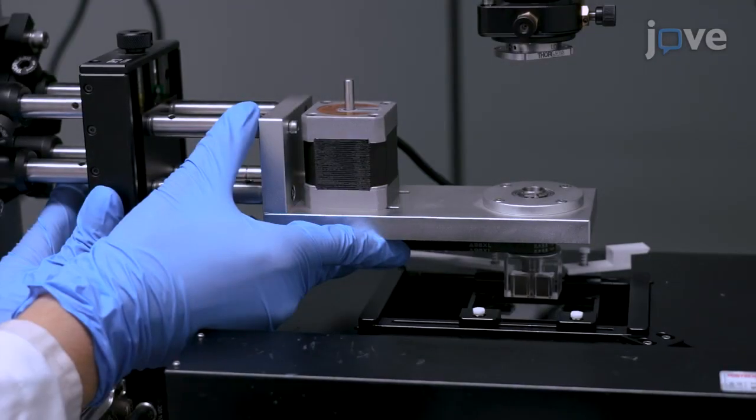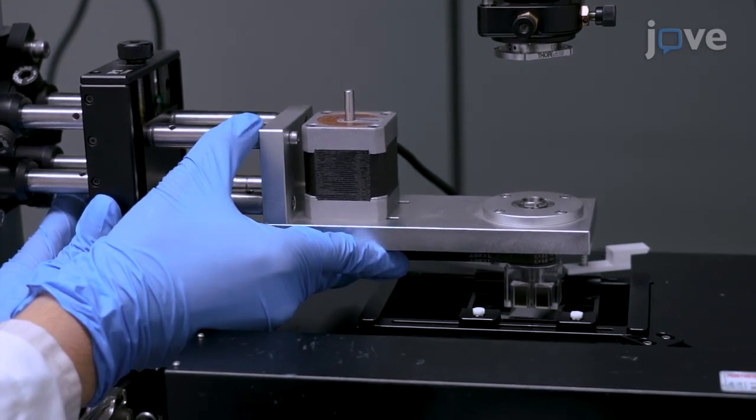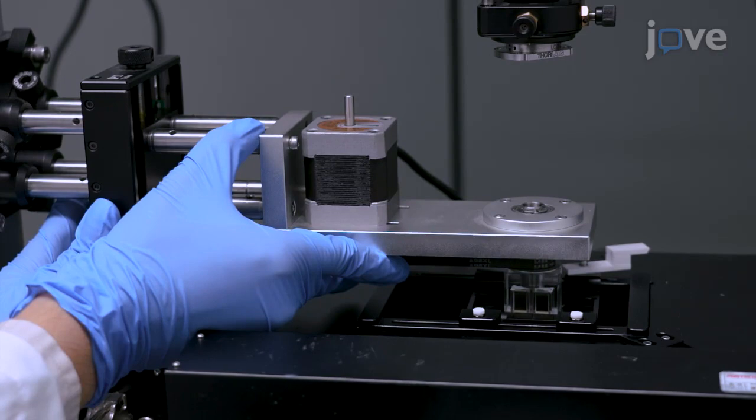Adjust the vertical position of the translation stage so that the magnet's bottom surface aligns with the sample plane at the lowest stage position.